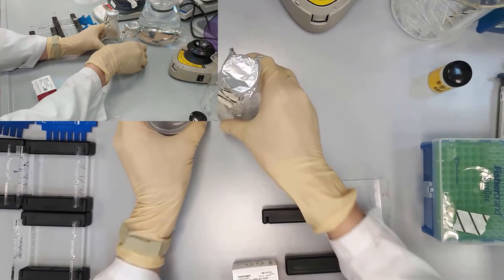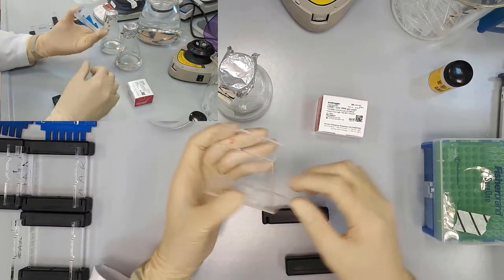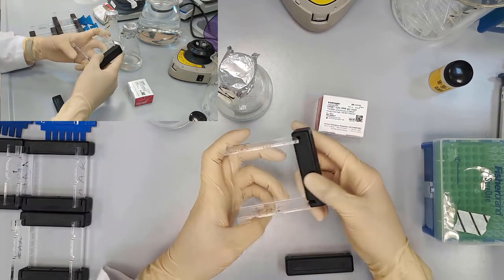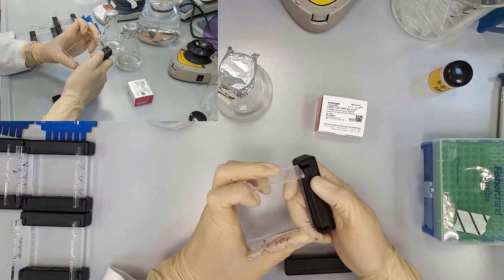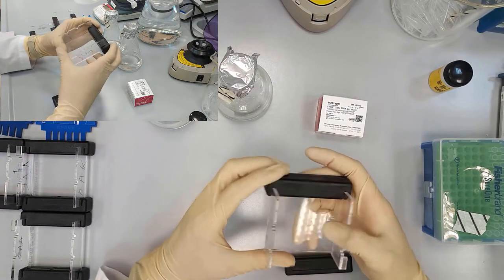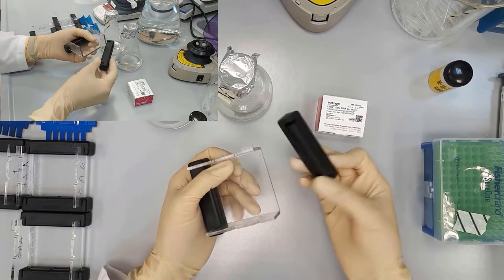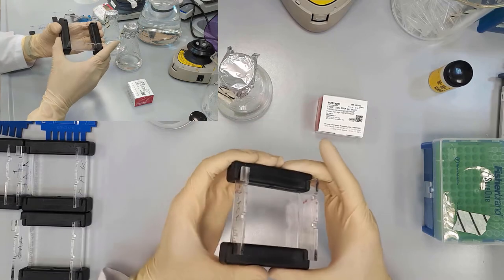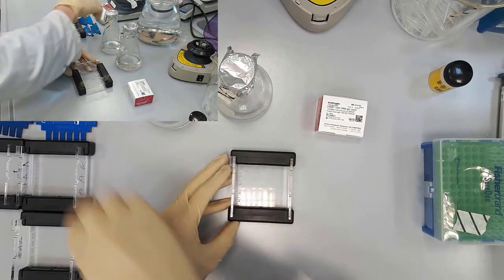Okay, so as we reach the point for casting the gel, we need to assemble the tray, and it is assembled with these black holders. So you push them inside so that they will be holding the gels. You just push them and make sure that they are neat inside this tray. The same goes for this part. So now it's set and we can cast it.